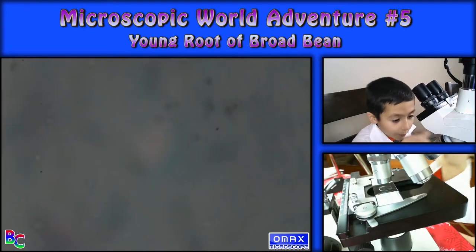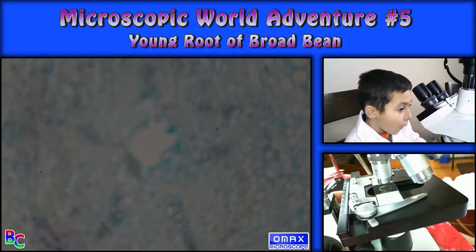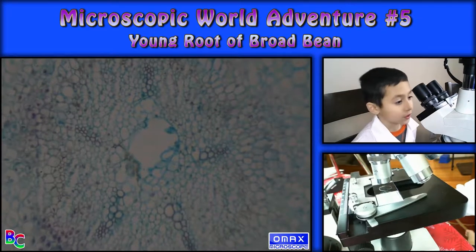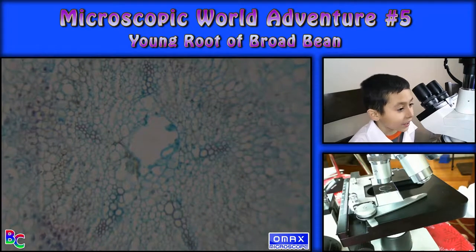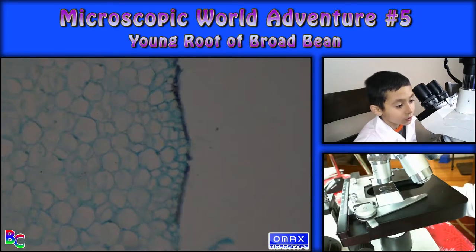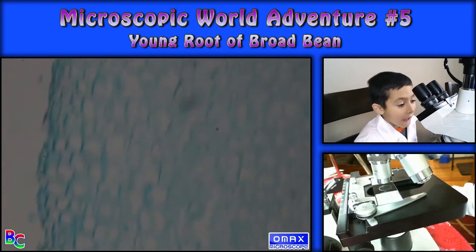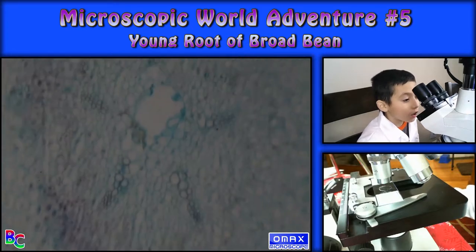Let's go to number two. Oh, I had no idea about this. Why is it like a star form? You see that, like a star form and a circle in the middle? I had no idea that was there. I have no idea why it has a star right there.